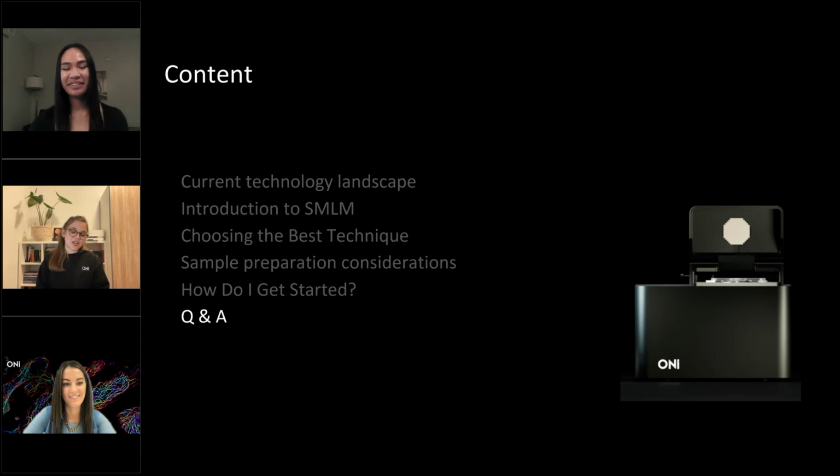So for more than 3 targets in the samples, as Vanessa already hinted, it's rather challenging because normally you are limited by the number of laser lines and filters in your microscope. Okay, and also especially for STORM, it's not so easy to find more than 3 compatible dyes that have this photophysics. So for this purpose, there is a whole research going on into PAINT approaches, especially DNA-PAINT, because DNA is very flexible in the design.